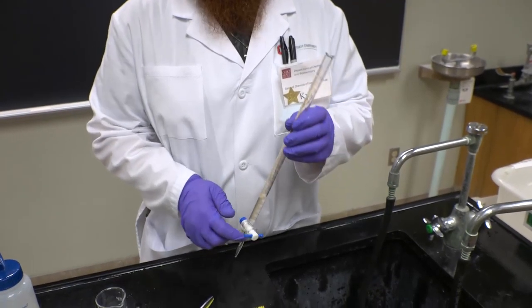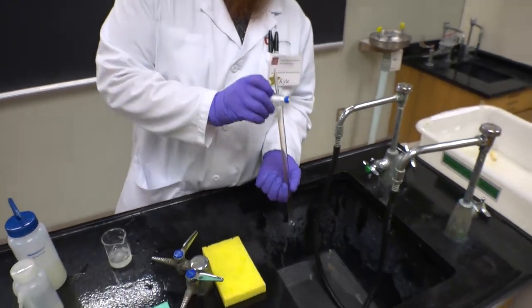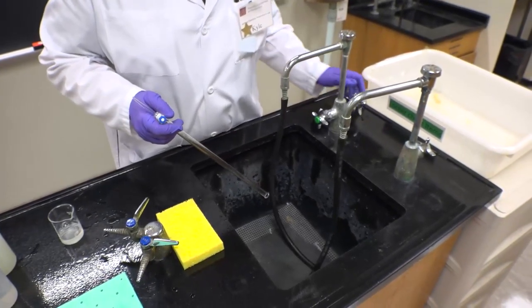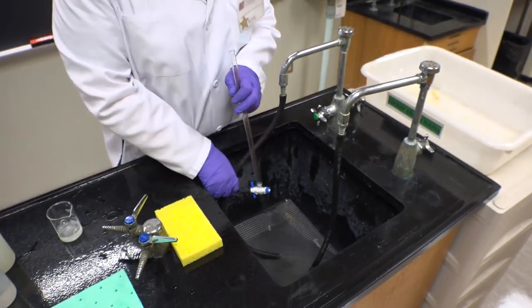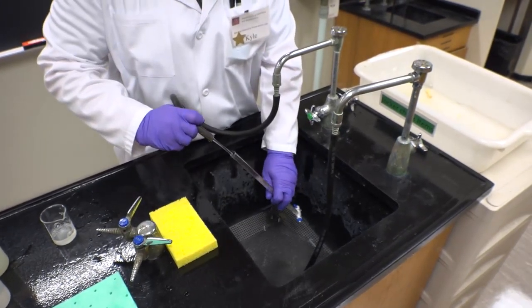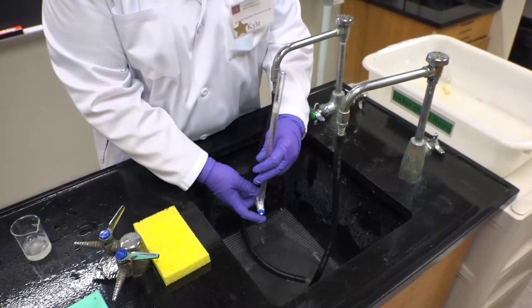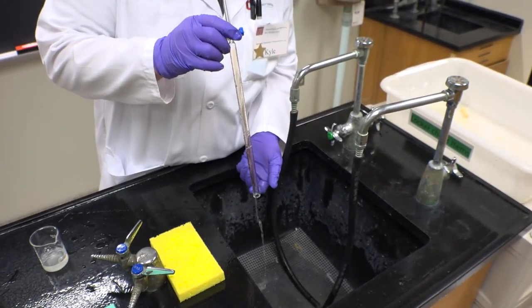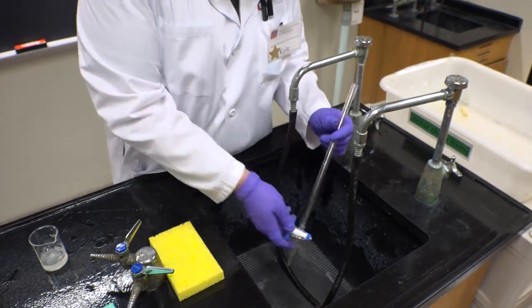From there, drain a little of the contents through the spout of the burette. Once that is done, you want to invert the burette and open the stopcock of your inverted burette to drain the detergent. You then can take your burette through the three tap water rinses and three DI water rinses, opening the stopcock with each rinse to allow some rinse to go through the spout of the burette. Then empty the rest of the rinse by inverting the burette with the stopcock open.